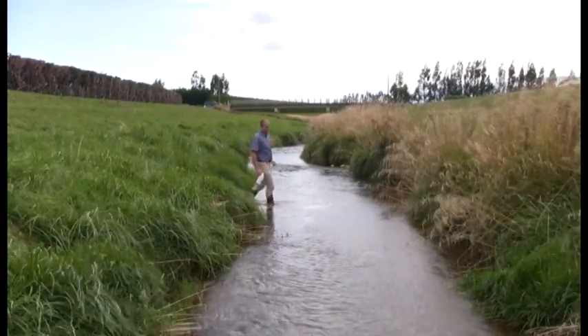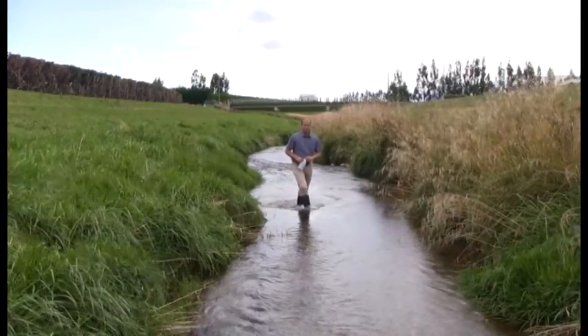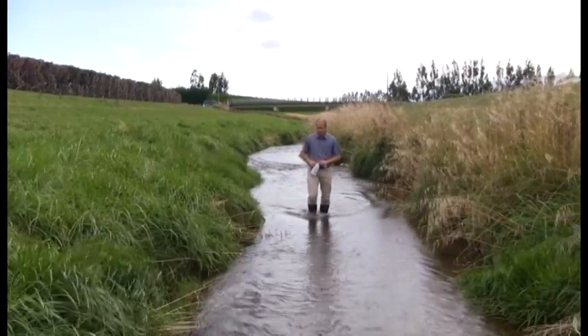If you entered upstream, sediment can run down and you'll capture that in your sample.